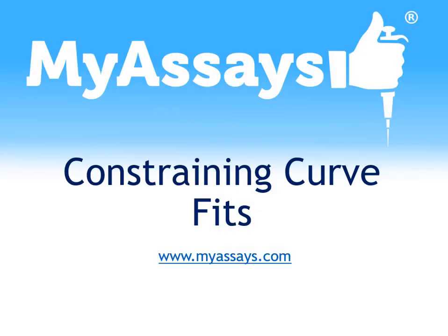In this video, I'll demonstrate how to constrain your curve fit. Curve constraints can be useful in certain applications. For example, when using a 4PL or 5PL model, it might be useful to constrain the upper and/or lower asymptotes of the curve to equal known saturation points like the NSB or B0.